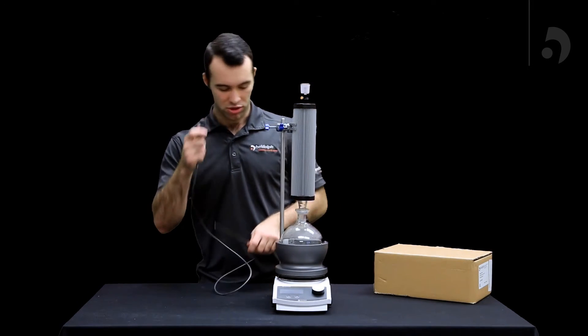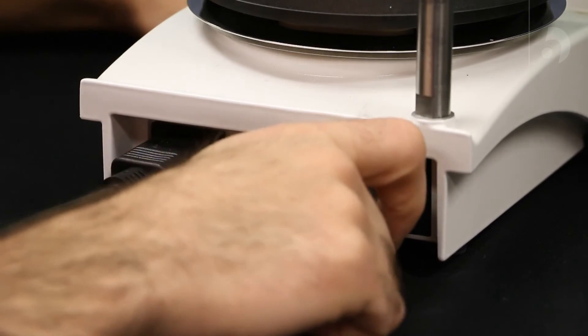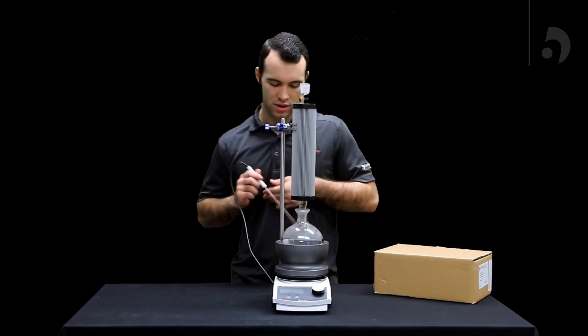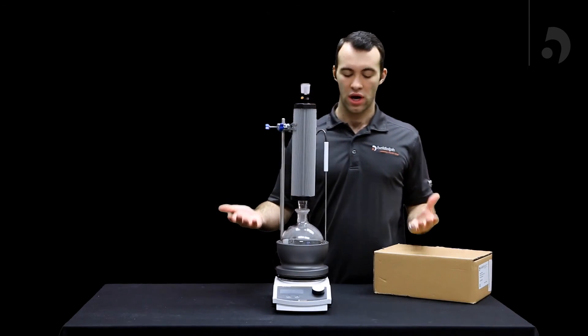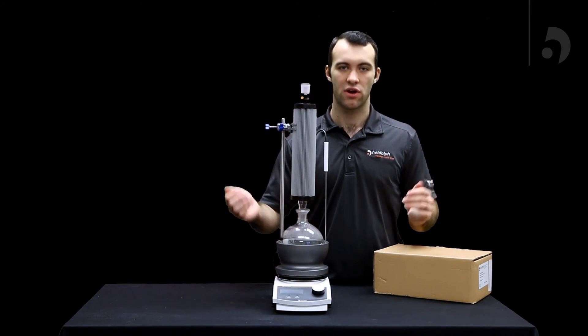Then all you have left to do is plug in your PT-1000 to the back, screw it on, and insert it into your heat-on block. That was your HiConnect assembly. Thank you very much.